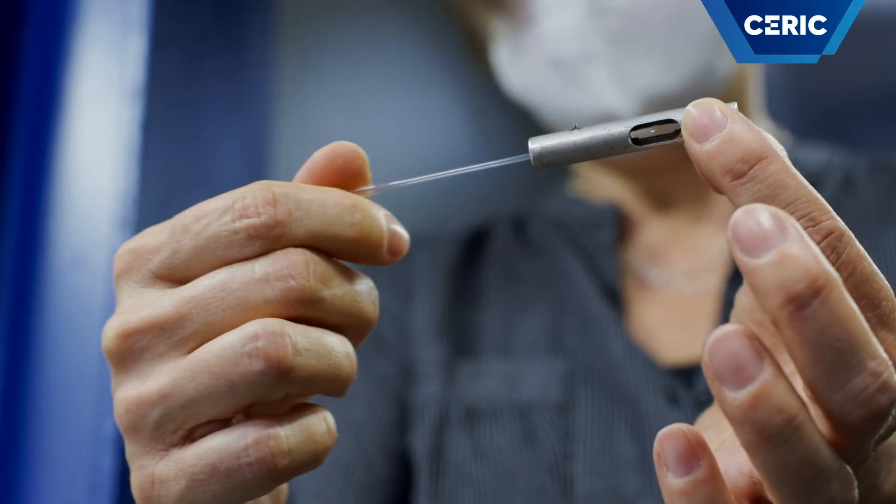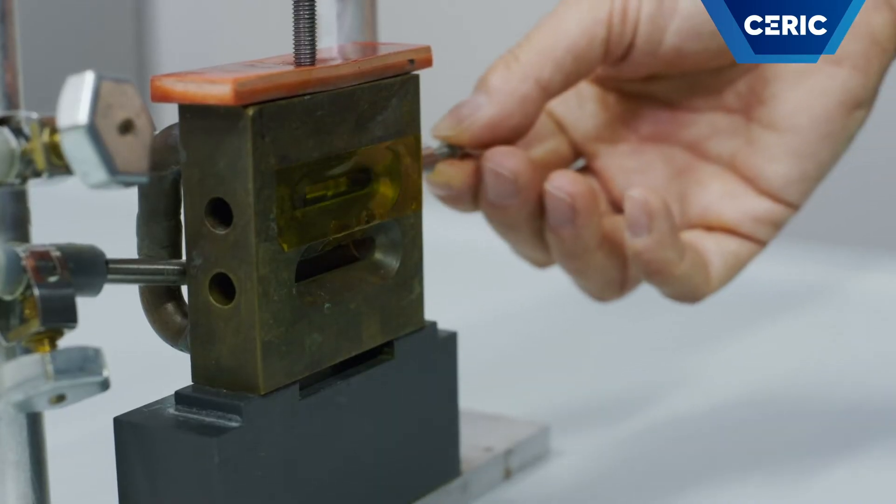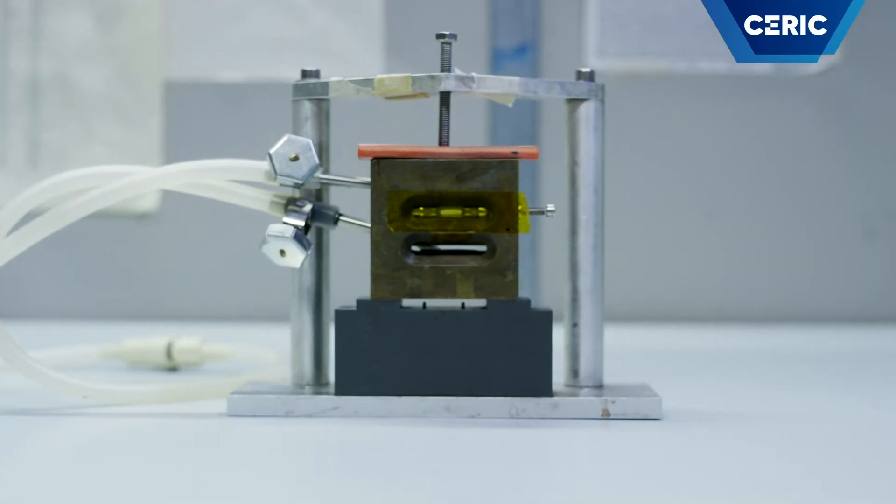Almost everything gives a SAXS signature and the sample environment is very flexible. We can study liquids, powders, solids, tissues, aerosols, and last but not least also surfaces by shining light under a small incidence angle onto it.